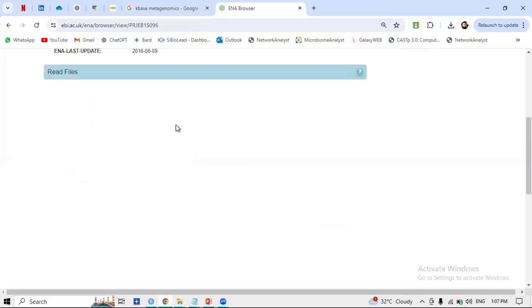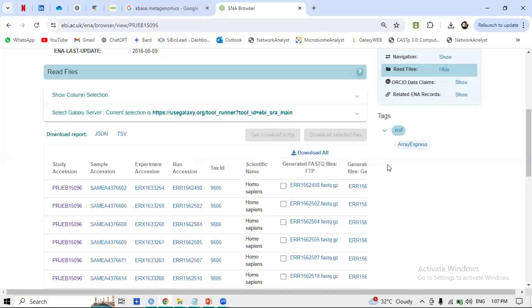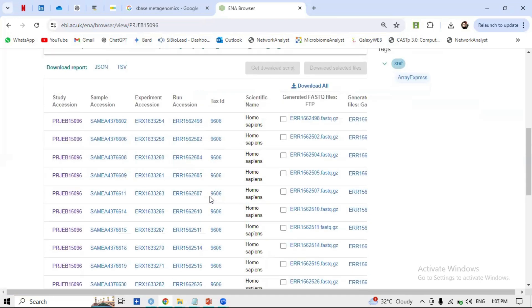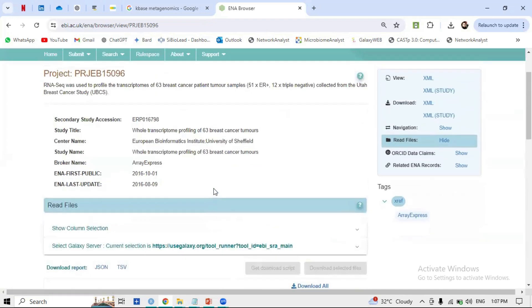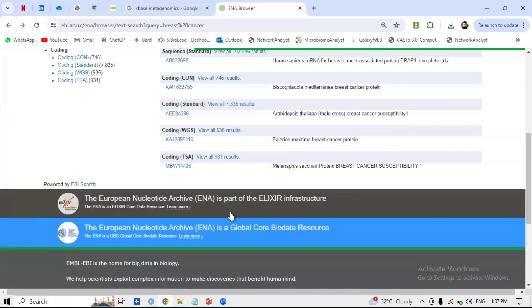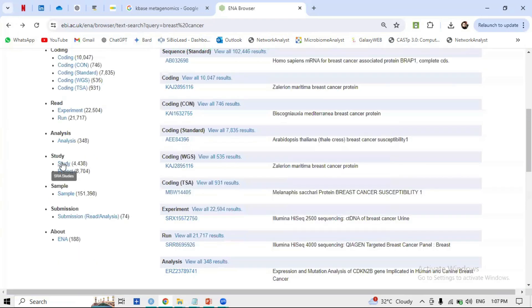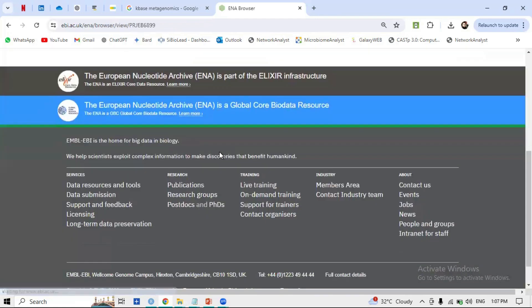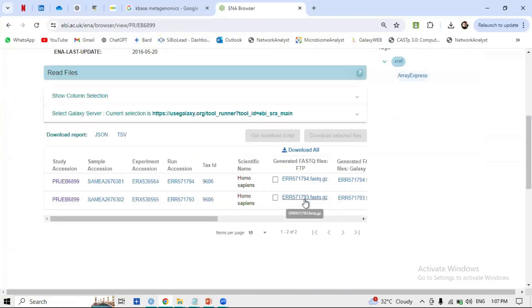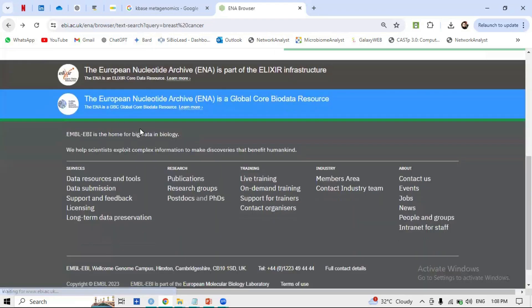Clicking on a study opens its page with an accession number (ERP...). Here you can see the files, but this particular study uses single-end reads, not paired-end, so we are not interested in it. Go back and try another study — for example, 'Breast Cancer Initiating Cell RNA-seq' — but that too turns out to be single-end, so we go back again.